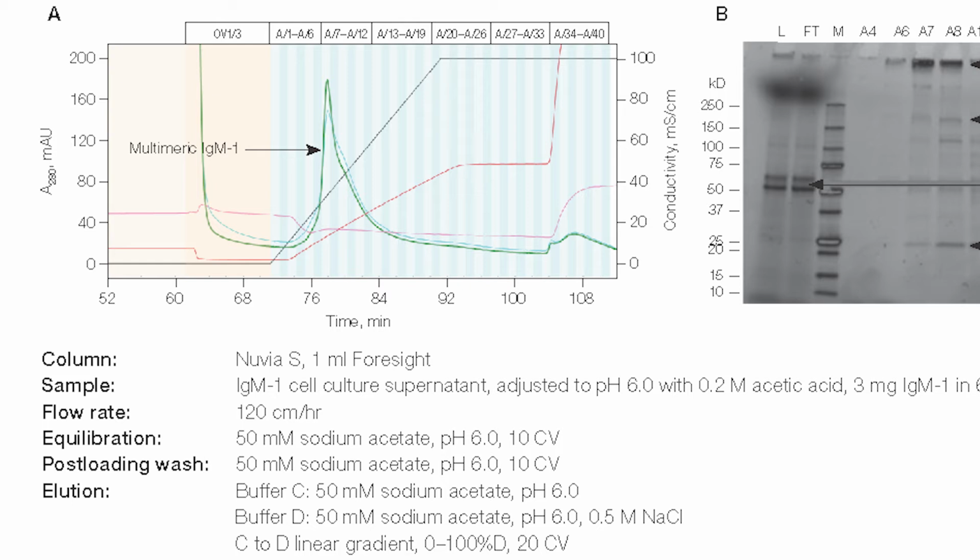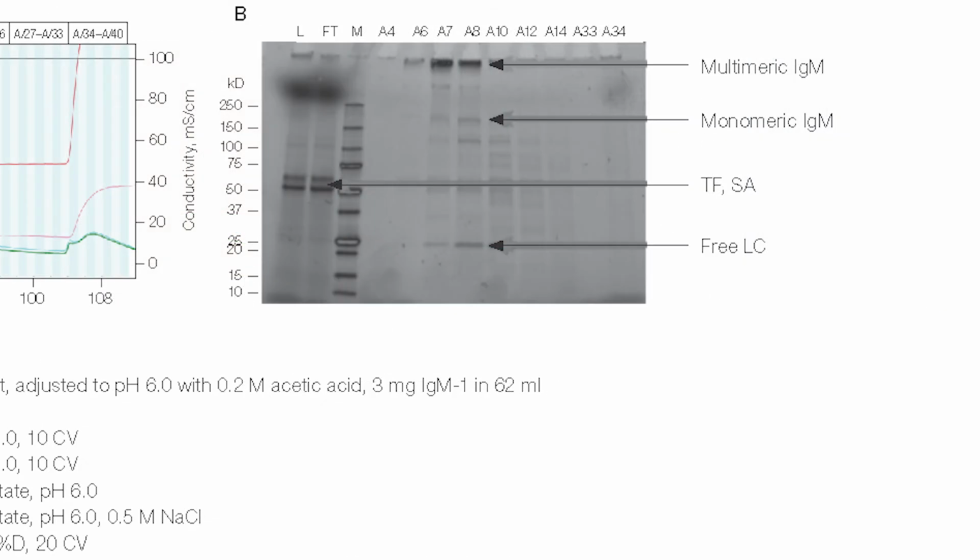And when you're doing it in that way, you can see that the profile in the chromatogram changes a little bit, so the maximum elution peak gets narrower, and you have a more pure product in the elution. So you can see that the amount of process-related, also product-related impurities gets significantly lower, and you've got a better purity coming out of this elution.